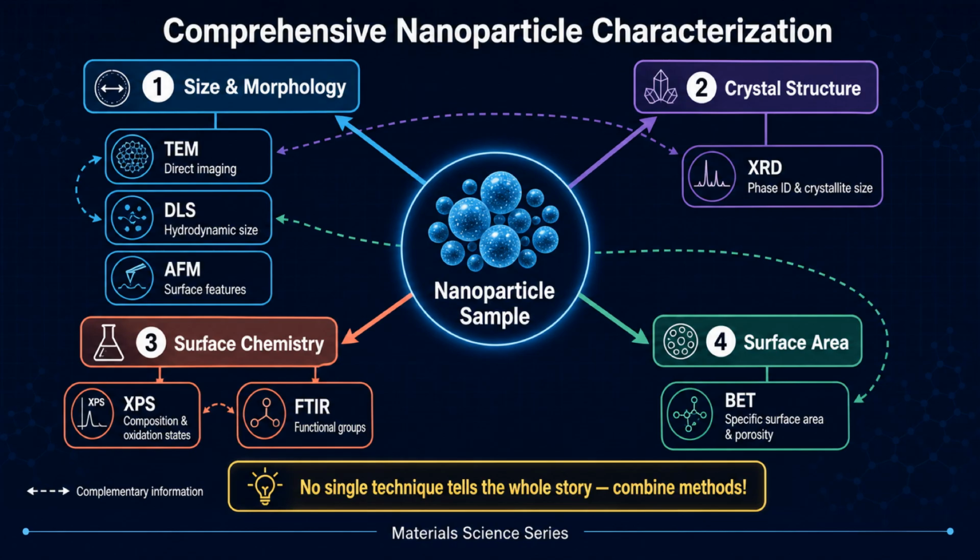A practical workflow might start with DLS to check if colloidal particles are the expected size, followed by TEM for detailed morphology, XRD for crystal structure confirmation, and XPS for surface composition.